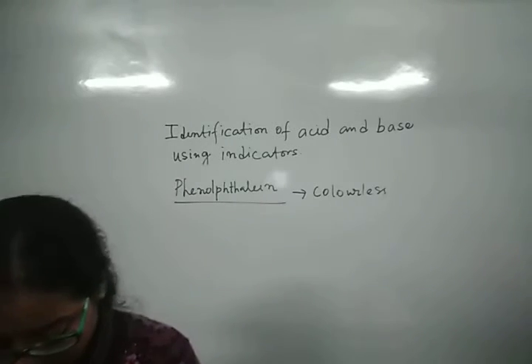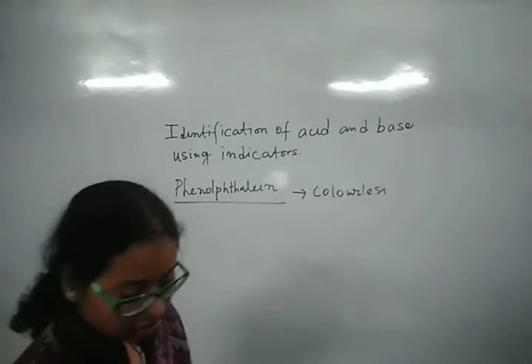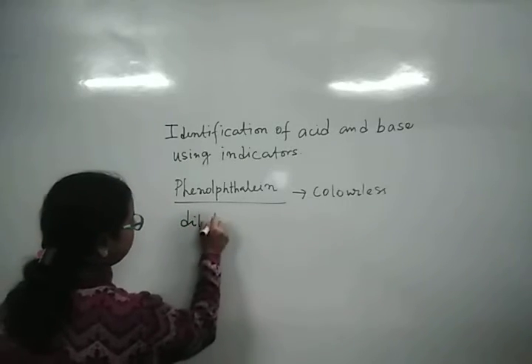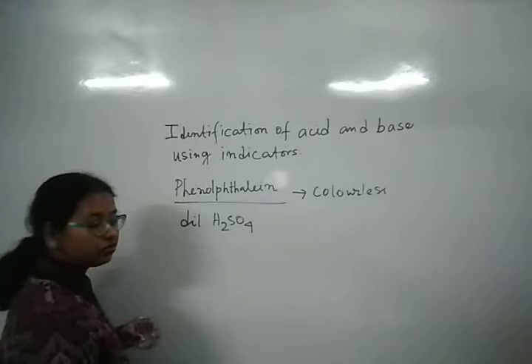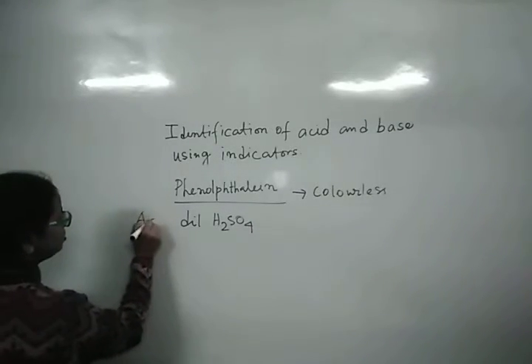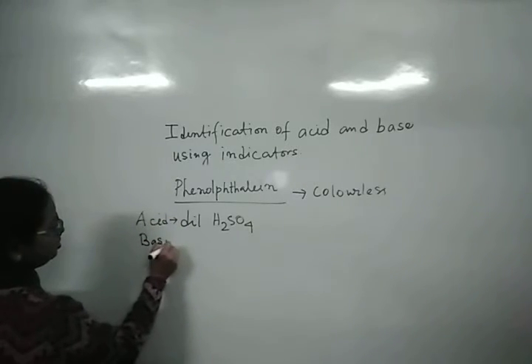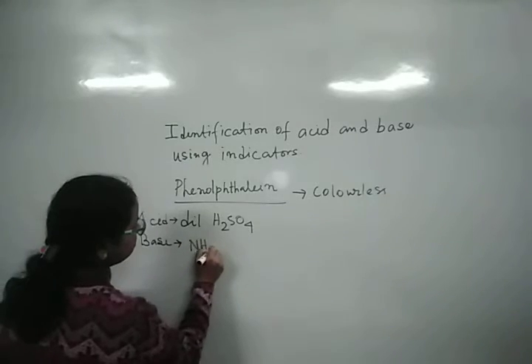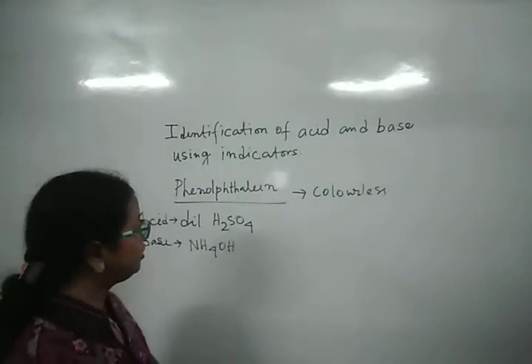Here I have taken dilute acid. I am using dilute sulfuric acid for the acid solution, and for the base we are using ammonium hydroxide solution, NH4OH solution.